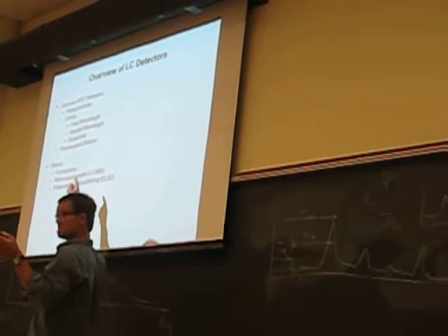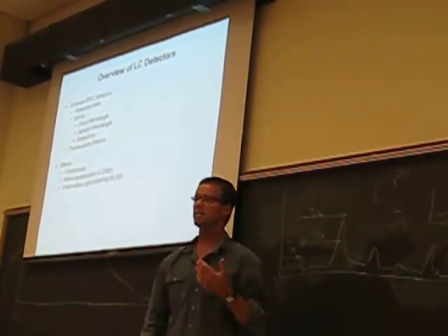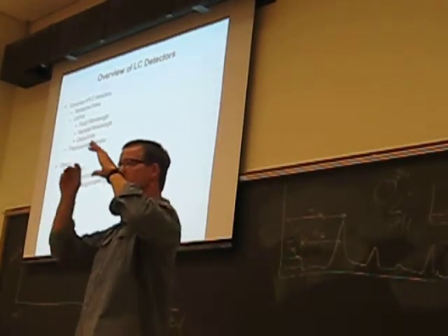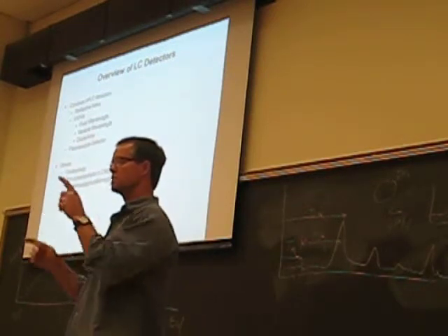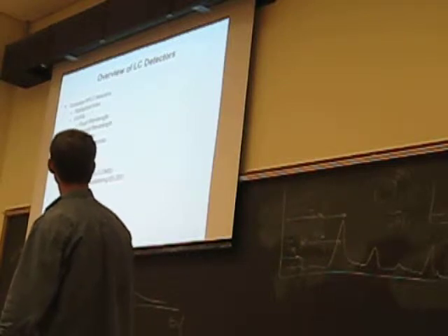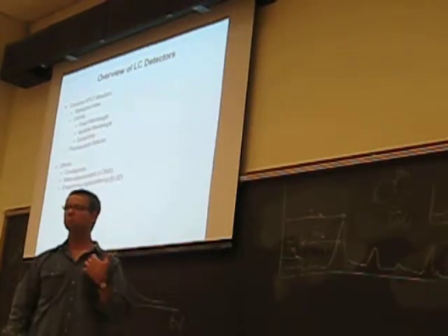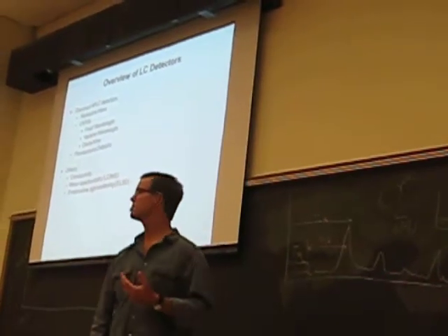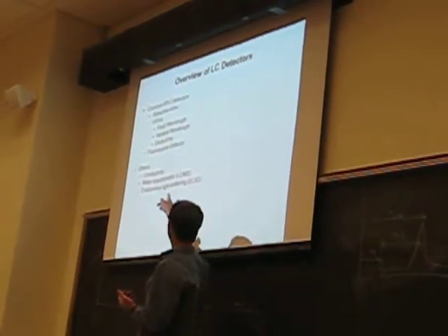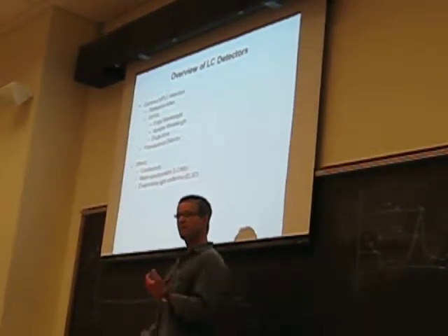Both in UV-Vis instruments and in HPLC detectors, probably a more commonly used kind of detector method now is what's called a diode array. The diode array allows essentially a simultaneous measurement of many different wavelengths, not just one at a time. Fluorescence detection is common. We talked about conductivity detection. Probably some of the most powerful kinds of methodologies that utilize liquid chromatography is when the instrument is married up onto some other kind of detector system, like a mass spectrometer.